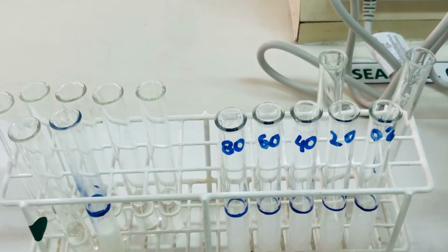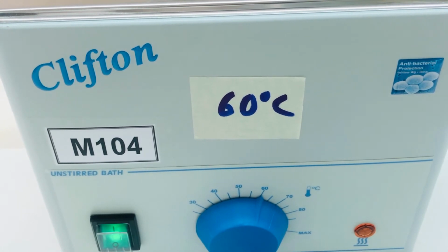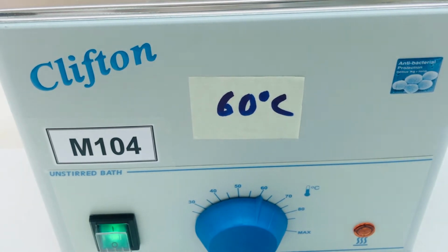The next step is to keep milk and the trypsin in water bath for 5 minutes so that they attain the temperature of the water bath. So, this is a water bath maintained at the temperature of 60 degree. Now, we are going to place the milk sample and trypsin in the water bath for 5 minutes so that they attain the temperature of 60 degrees.